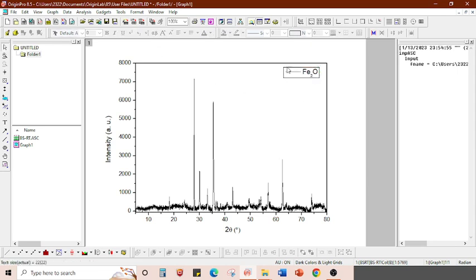Personally, I do not like to have a box above this. So I click on this, I get these six dots, and then I right click.